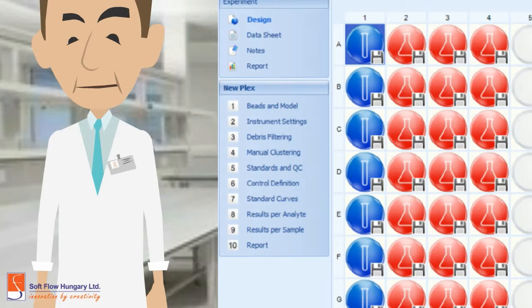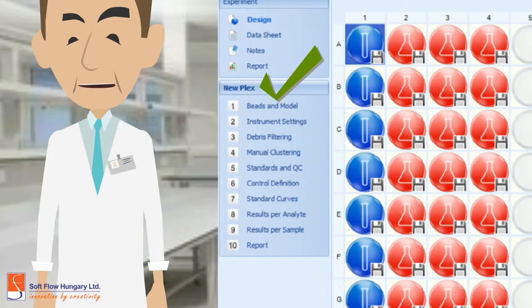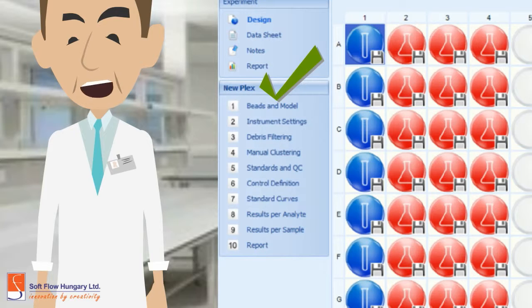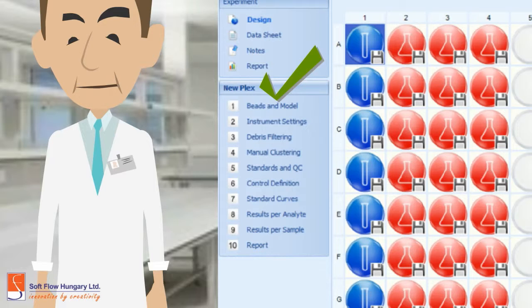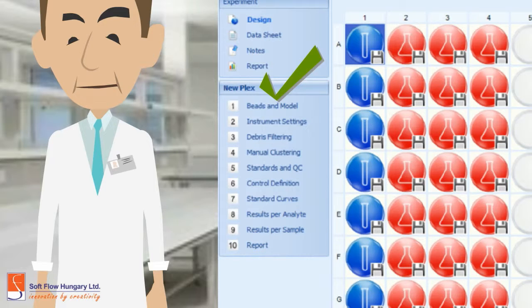Beads and model, instrument settings, debris filtering, manual clustering, standard and quality control, control definition, standard curves, result per analyte and per sample, and report.